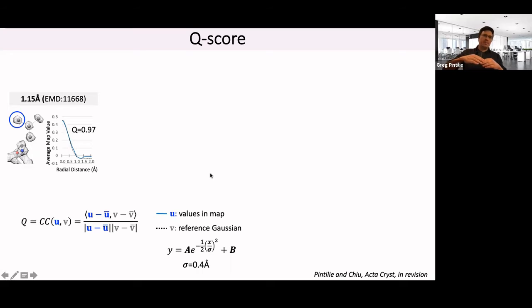let's say the mean value plus some number of standard deviations. If you take the highest value in the map and use that, there might be some noise spikes, so that's not always great. So the height is set as 10 standard deviations above the mean, and the offset is set as 1 standard deviation below the mean. That's because if you go too far below the mean values, then you start to really just hit noise.